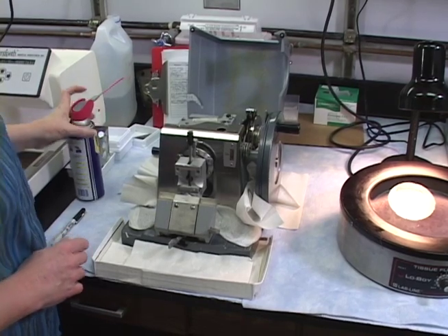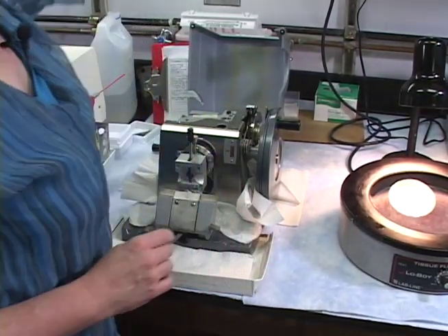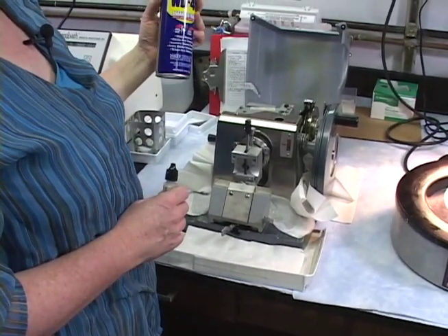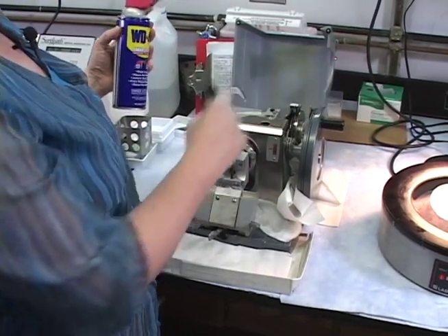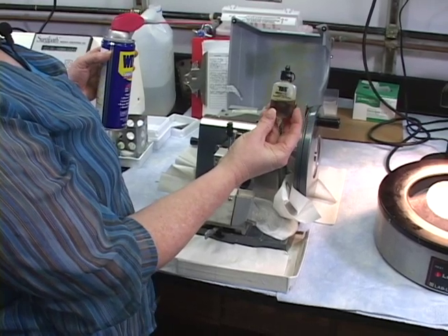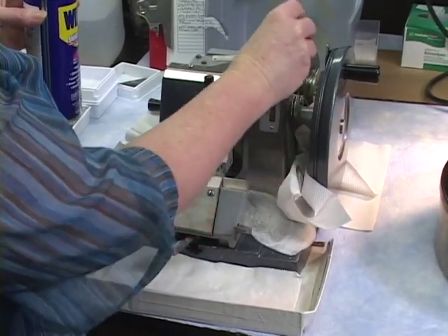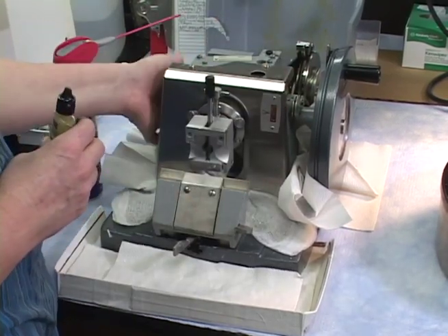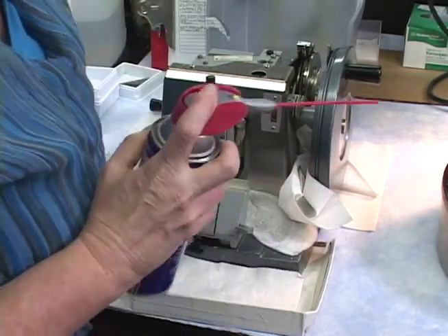We also have regular Microtome Oil, and at some point you may want to start using that. Probably for the next year or so, I would like to keep using the WD-40 because I'm trying to get rid of that residual grease, because this Microtome actually was as stiff as that one, and it's not any longer. But we have this regular Microtome Oil, and you would do the same things by putting drops of oil in these different holes and on this slide and trying to get some oil down in. It's actually easier with the straw on this.